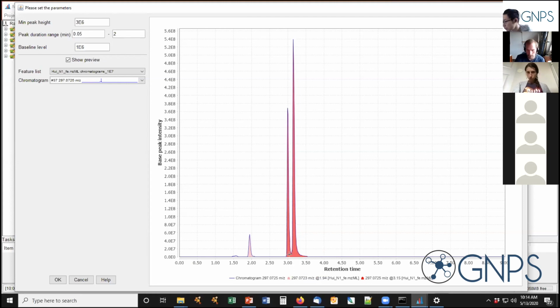So although we have a clear separation, the signal never goes below the baseline, and hence the baseline cutoff, which basically just draws a line at the baseline noise level, does not recognize that. So if I quickly note this down, so that would be.